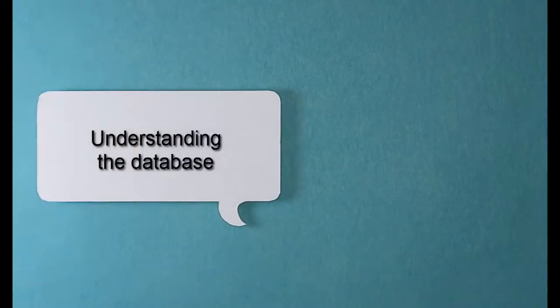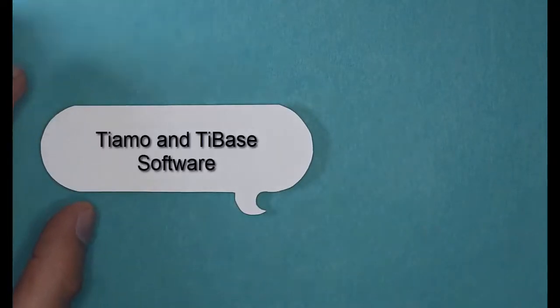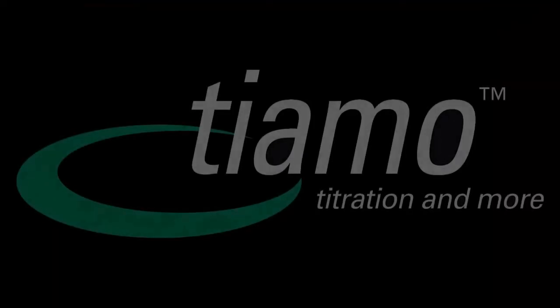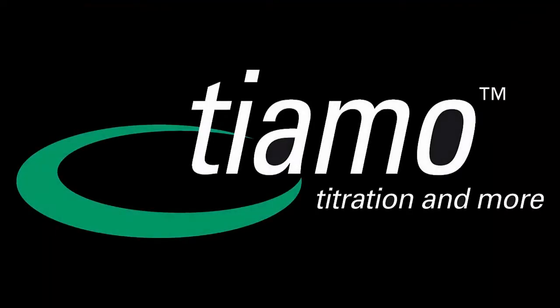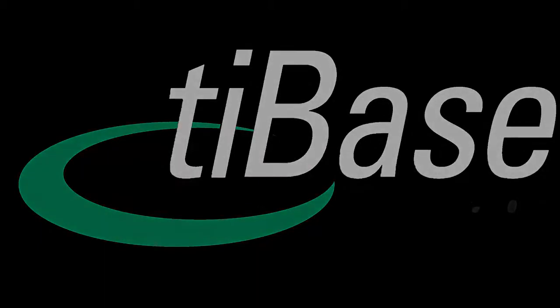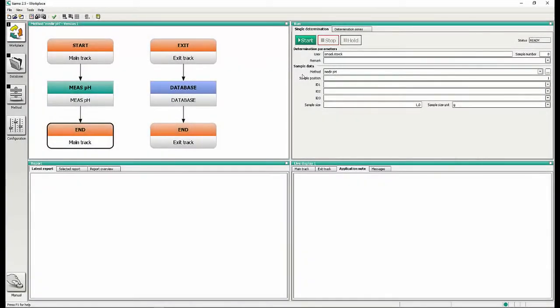Understanding the Database: tiamo and tiBase Software. Here you will learn the most important functions of the database of your tiamo and tiBase Software.